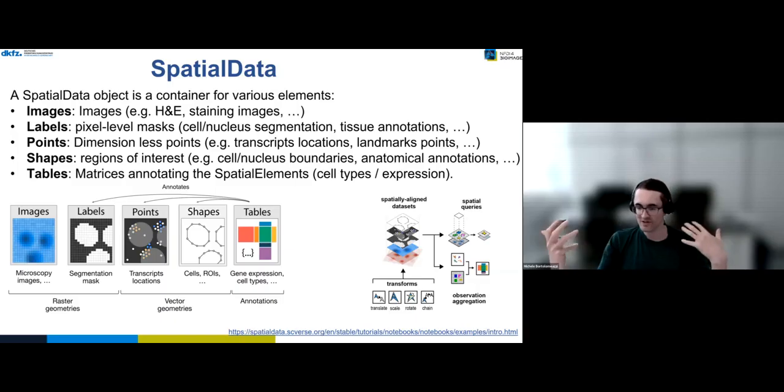But also, if you start having more complex experimental workflows, where you are going maybe for some multimodal experiment, meaning you run your Xenium spatial transcriptomics and then perform COMET on it, so the spatial proteomics experiment on top.